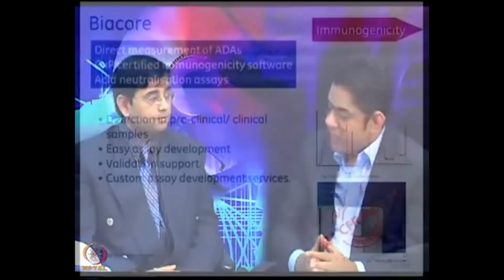I think that's a very strong application, because many times you'd like to know how accurately you can determine the protein concentration. Absolutely, especially in quality control and in filling of biopharmaceuticals, where people need to exactly estimate how much they are actually filling in the final vial that goes to the patient. They need more accurate methods of measuring active protein concentration, and that is where I think Biacore will play a very big role in letting people estimate that active protein concentration.